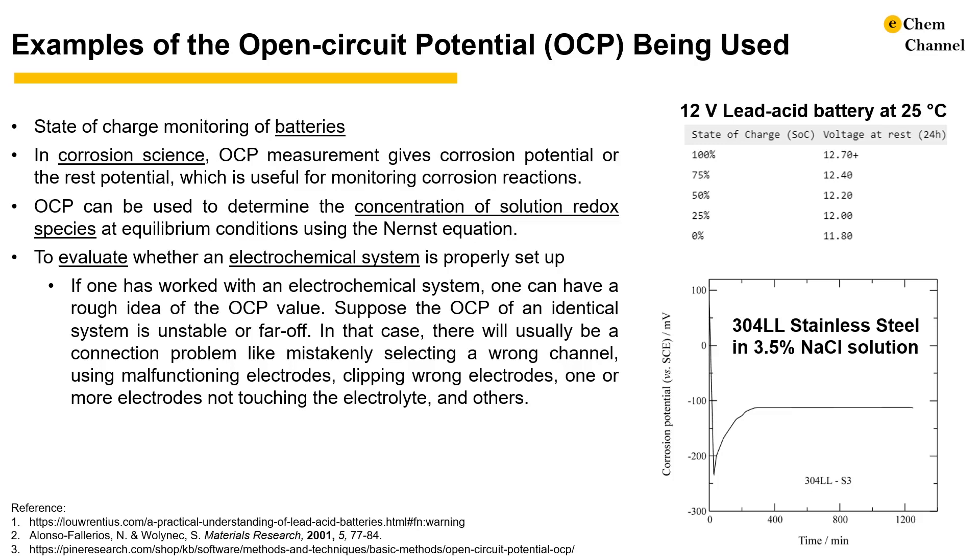Suppose the OCP value of an identical system is unstable or far off. In that case, there will usually be a connection problem like mistakenly selecting a wrong channel, using malfunctioning electrodes, clipping wrong electrodes, having one or more electrodes not touching the electrolytes, and others.